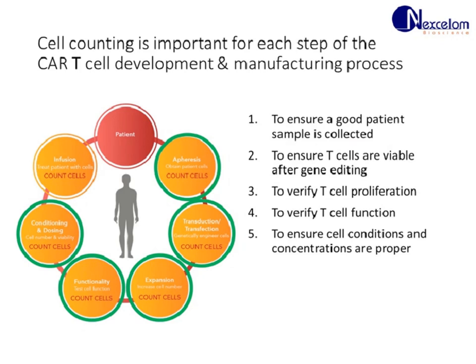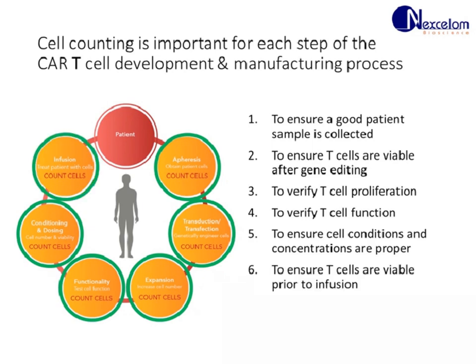Next is to ensure cell conditions and concentrations are proper for dosage. And finally, ensuring the gene-edited T cells are viable prior to infusing back to the patient.